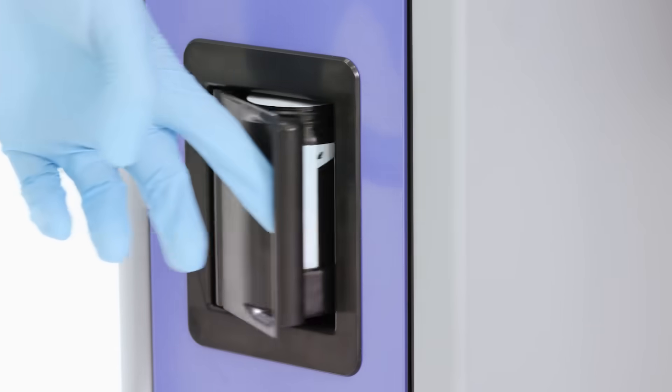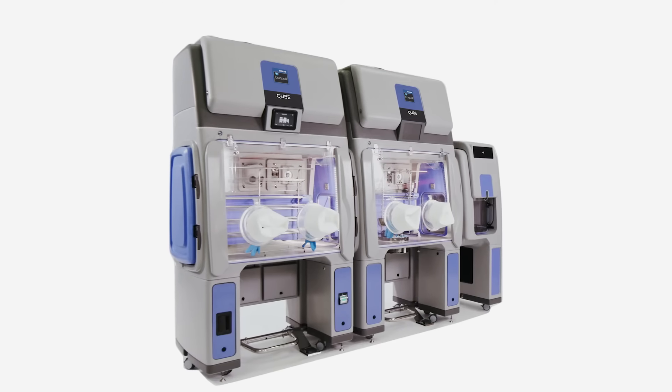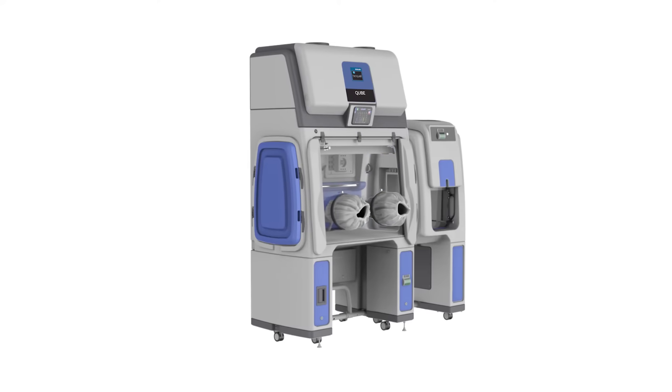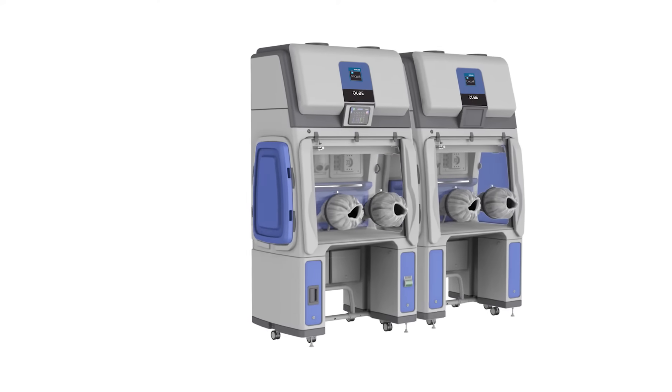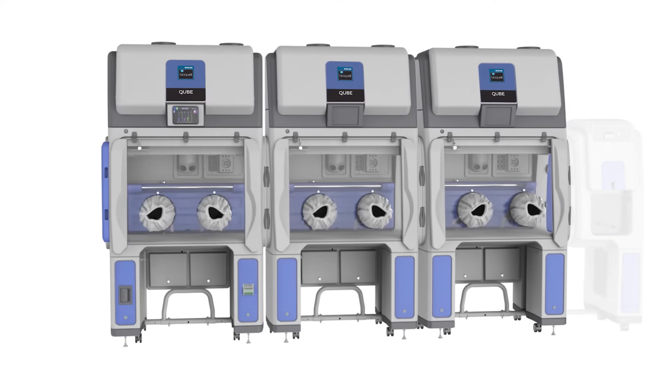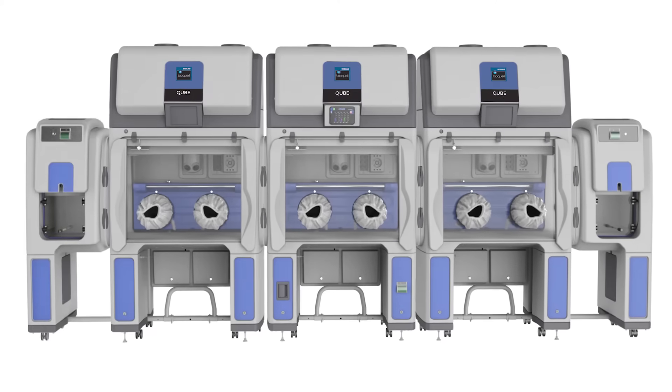The BioQuell Cube brings efficiencies and reliability to your sterility testing process. Available in two, four or six glove configurations with up to two material transfer hatches, the BioQuell Cube's modular design can meet your company's sterility testing needs.